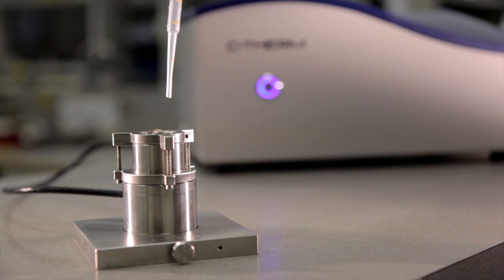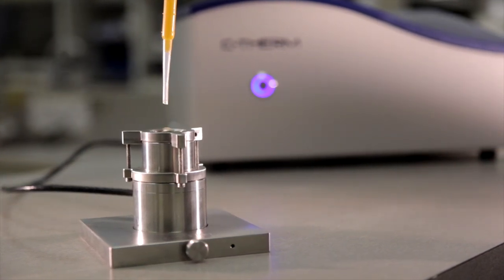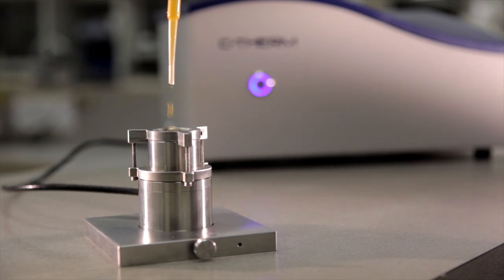The small volume test cell is optimized for testing the thermal conductivity of liquids and minimizing sample volume requirements.